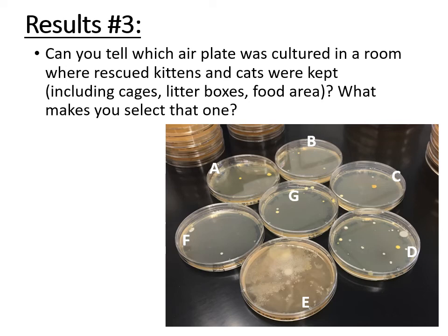Result 3, these are air plate results, real air plate results. Okay, so students opened up, removed the cover, and left that agar sitting in different locations.